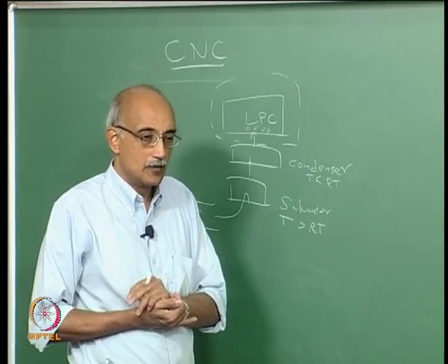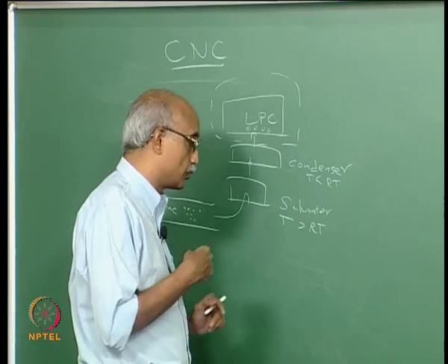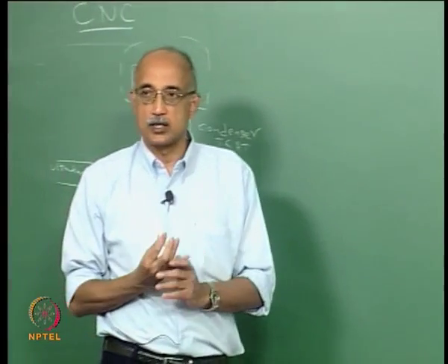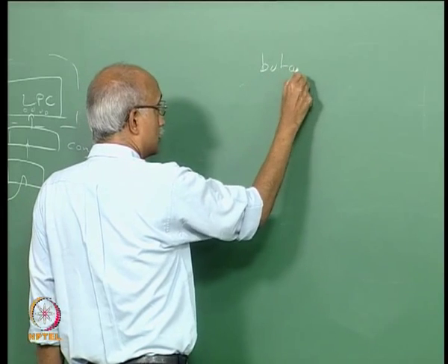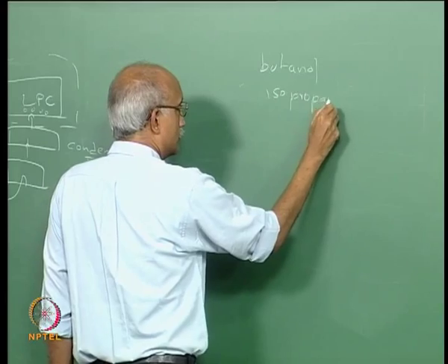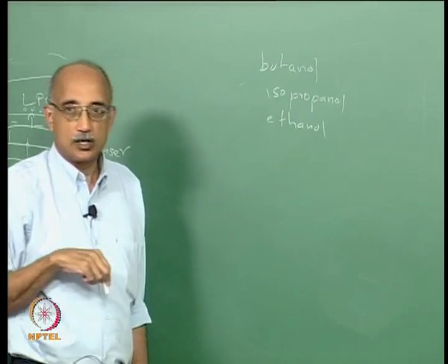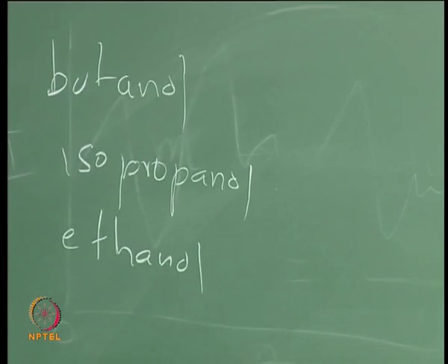Before that, we should talk about how you do the saturation. What are some of the vapors that are commonly used to grow these ultrafine particles to a fine particle size range? You typically do that using organic solvents such as butanol, isopropanol, ethanol. The problem with butanol and isopropanol is they are toxic and they also have a kind of a bad smell, but they are very, very good.